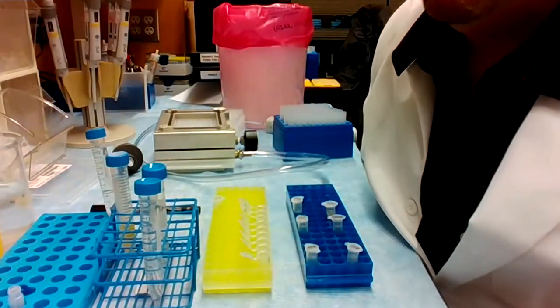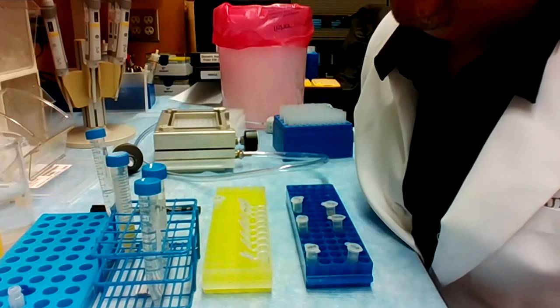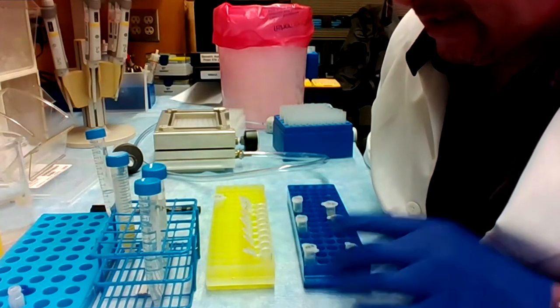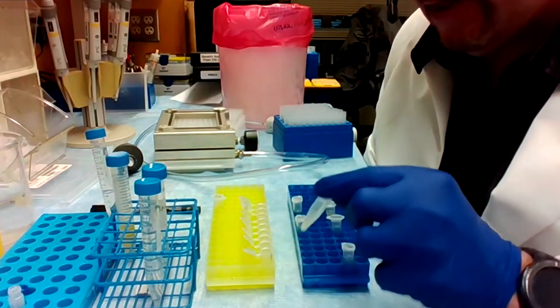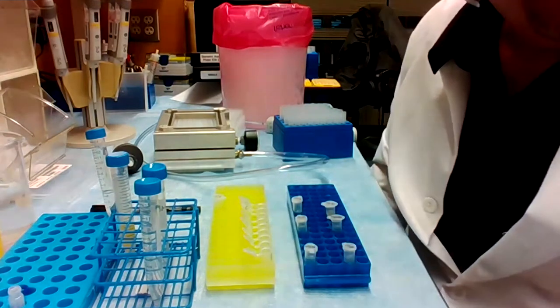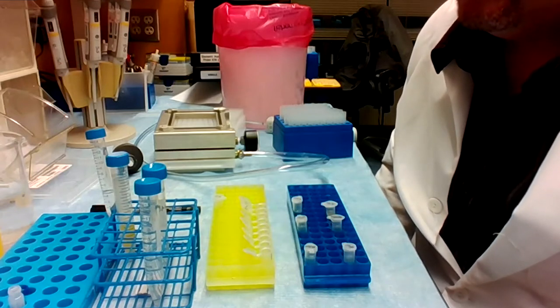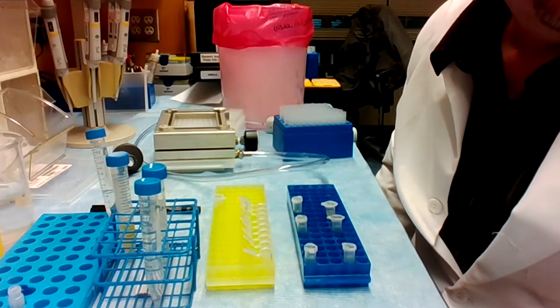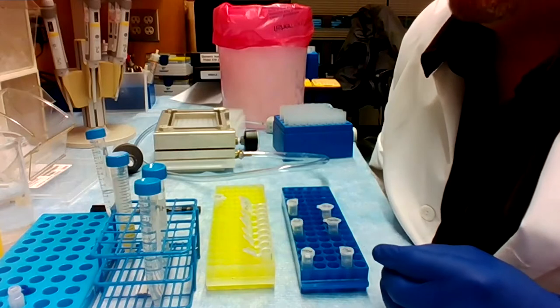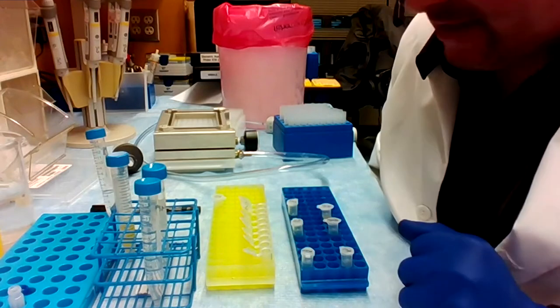For today's example, we're using LMP744. This assay was developed about eight years ago when we had an older mass spectrometer that didn't have the sensitivity of the mass spectrometer I showed you today. If I would do this method over, I would probably do a C-nitrile dilute and shoot where I would add acetonitrile to the plasma, vortex it, spin it down, and inject it straight into the mass spectrometer. But our older mass spectrometer didn't have that sensitivity, so we had to concentrate our drug — we would use 200 microliters of plasma, extract the compound with ether, blow it down, and resuspend it in 50 microliters, making it four times more concentrated. We needed that with the older mass spectrometer.